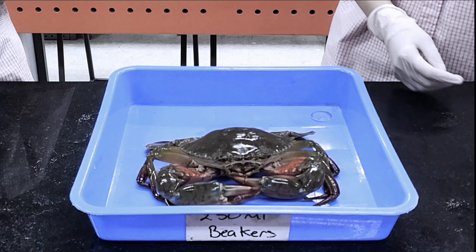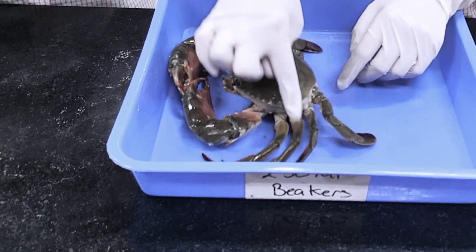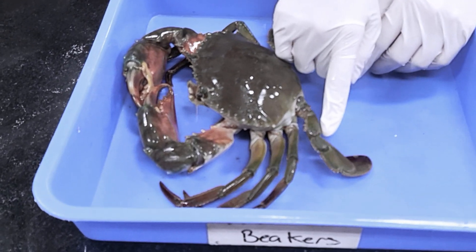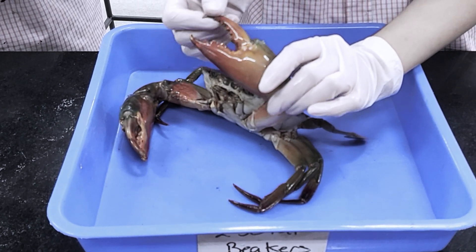Let's start with its external structure. A crab usually has eight legs and a pair of claws. Crabs use their claws or pinchers for self-defense, food gathering, and fighting.